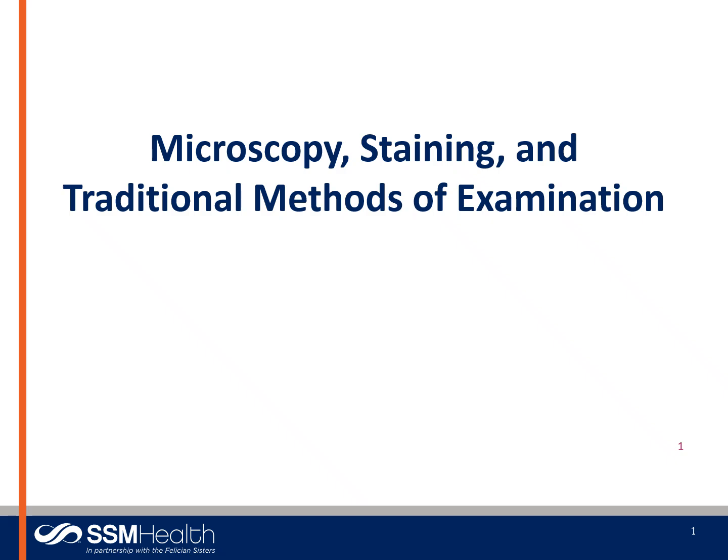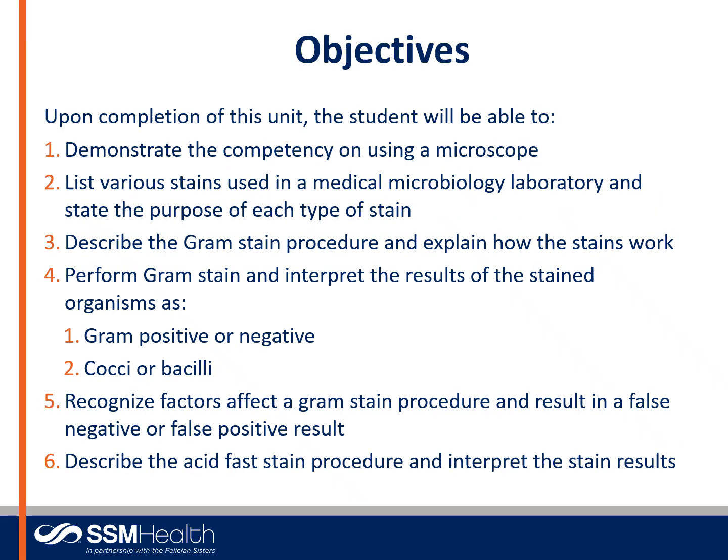This unit, we're going to discuss staining processes and using different types of stains and their methods of examination, along with some basic tips on microscopy. Please review these objectives on this unit.